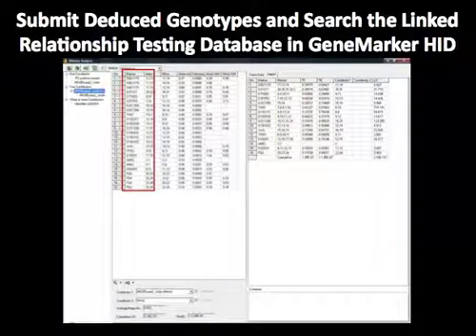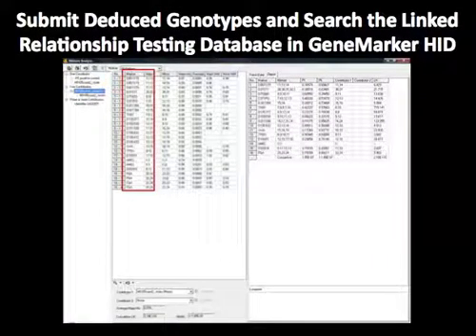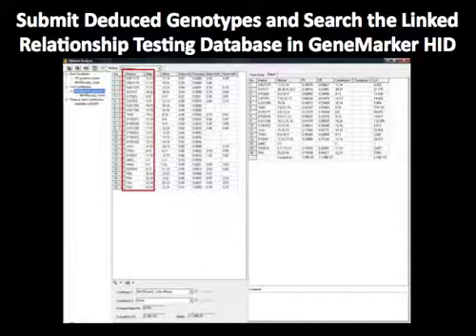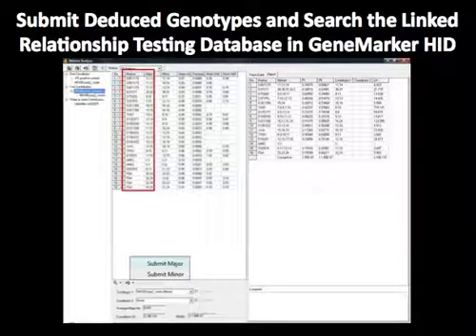In this particular case, the victim's single source file is the minor contributor. There is not a reference file for the perpetrator or the major contributor. However, there is a unique deduced genotype for the major contributor for all loci. To submit this deduced major contributor genotype to the database, select the lower right icon and choose Submit Major.